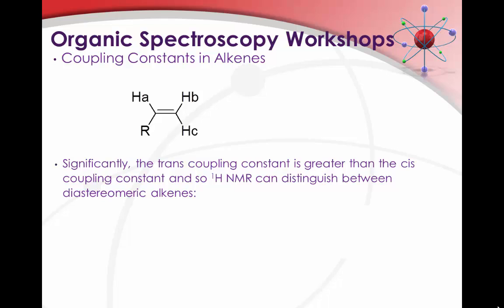The geminal sp2 hydrogens in this example will resonate at slightly different frequencies because they exist in slightly different chemical environments. This will be reflected in the coupling constant between Hb and Hc, as well as in the coupling constant observed between each of these protons and Ha.